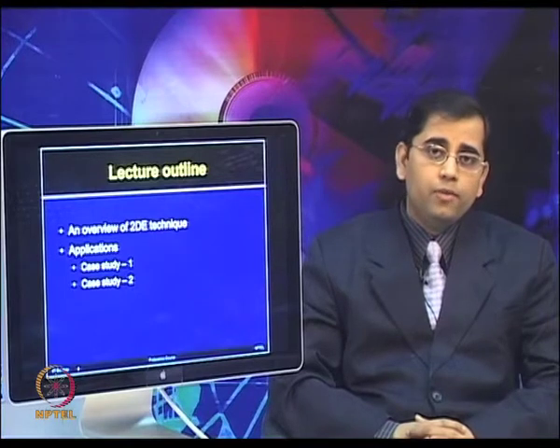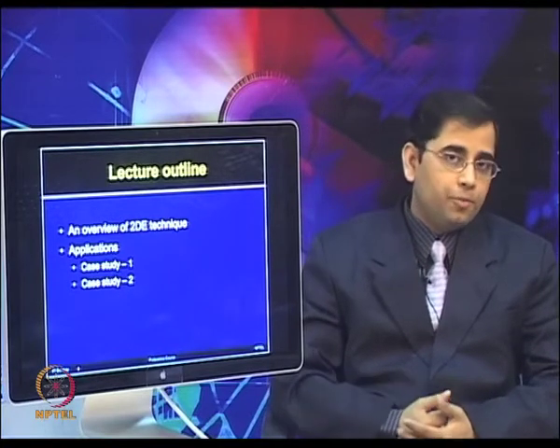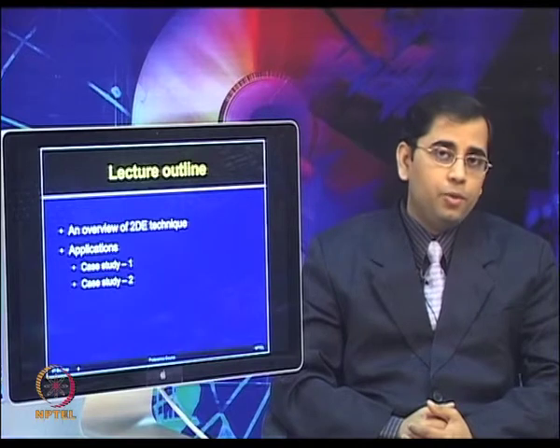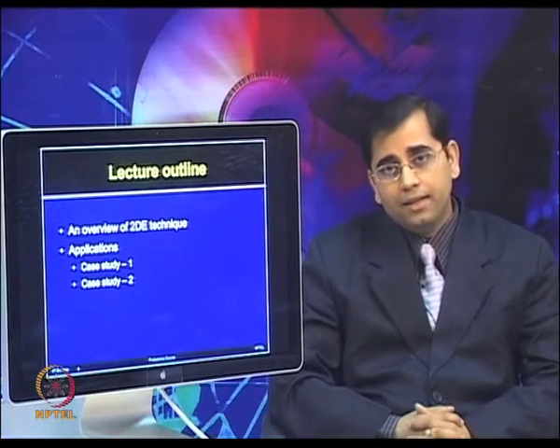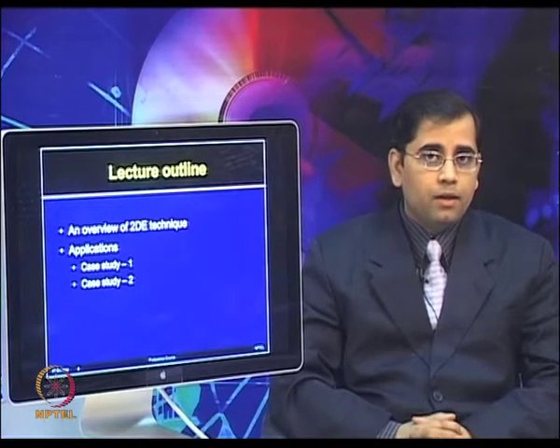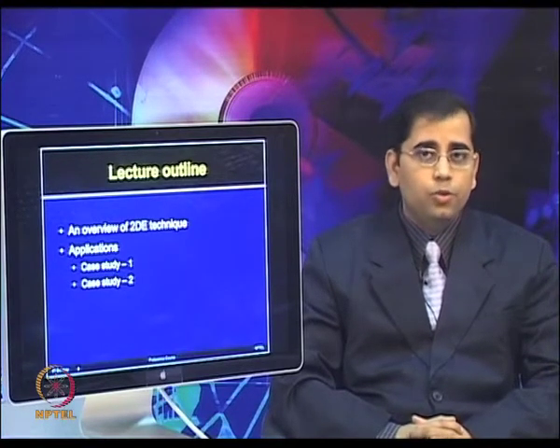Now, if you are interested in investigating all the proteins of a given sample, that will be considered global proteome profiling. Many times, if the proteome of a given species is not known, then proteomic techniques are used for global proteome profiling, but most commonly they have been used for differential proteomics. So, today we will discuss two papers where authors have applied differential proteomic analysis by using two-dimensional electrophoresis.